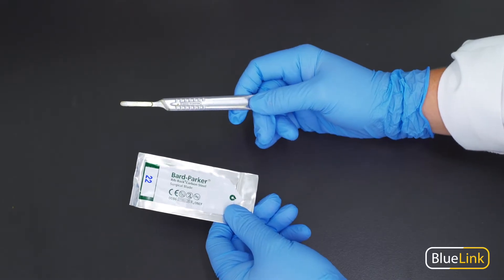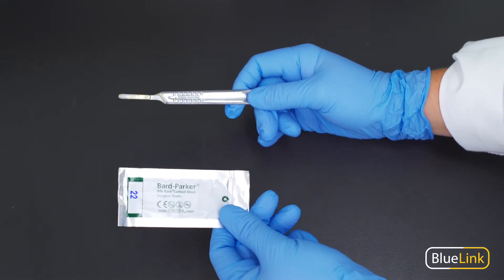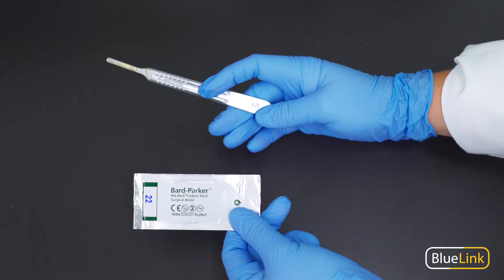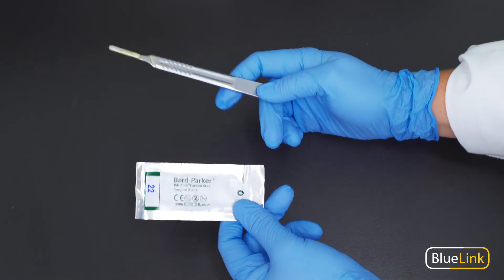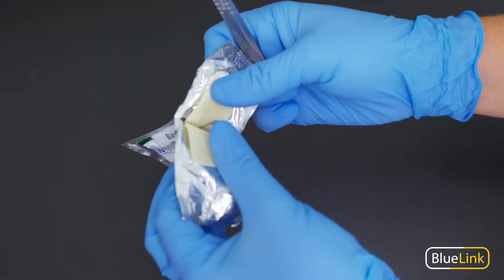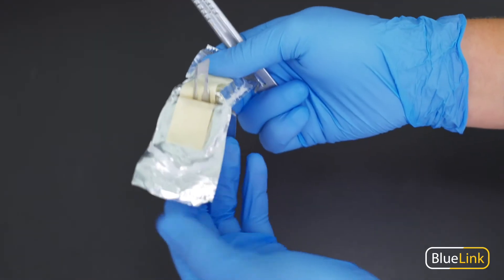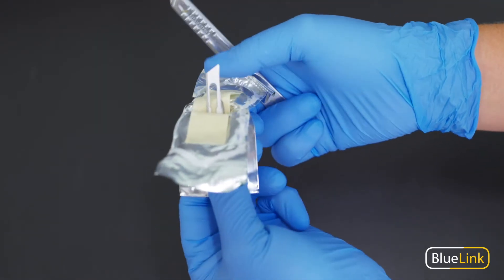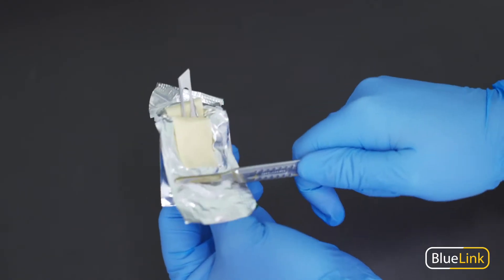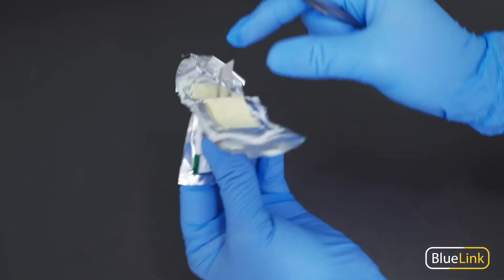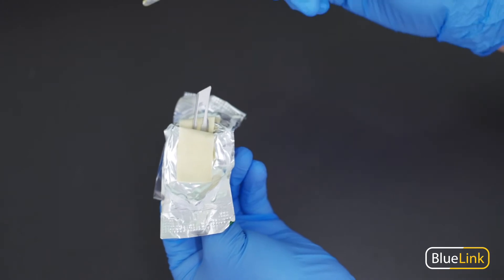So when you're ready to load your scalpel, you'll need your 22 scalpel blade and a number four scalpel handle. You'll go ahead and open this aluminum packaging that the blade comes in and you're going to open it about halfway because we want to leave the blade within its protective covering so that we don't cut ourselves on the sharp edge of the blade.